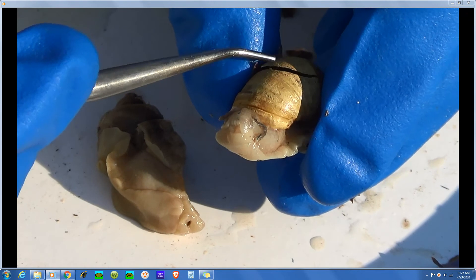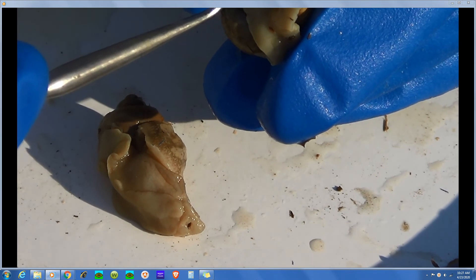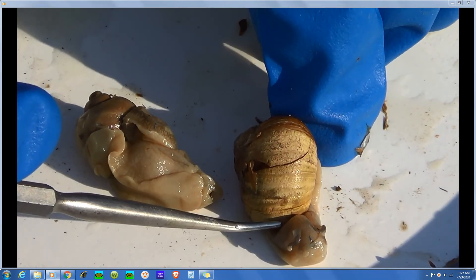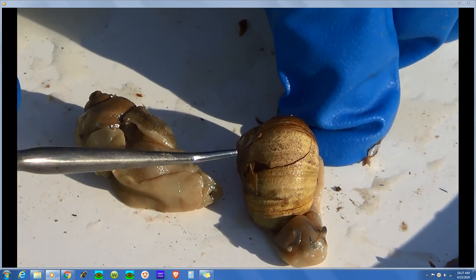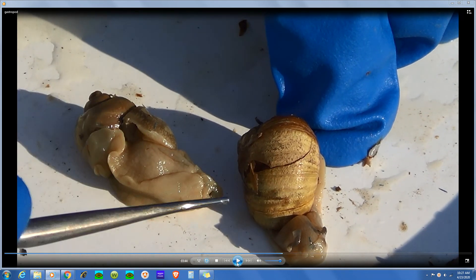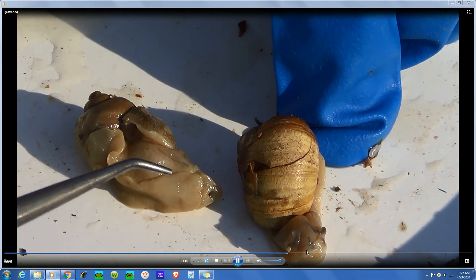I broke the shell accidentally, so I guess we're going to have two of them where we can see inside. Down under here is the edge of the mantle. The mantle houses the mantle cavity and protects the gills if there were any, and it also secretes the shell. On this animal, the front of the mantle secretes calcium carbonate faster than the back, and the left side of the shell secretes calcium carbonate faster than the right. That's why the whorl coils to the right — the side that grows faster pushes the shell over to the opposite side, causing the shell to coil.